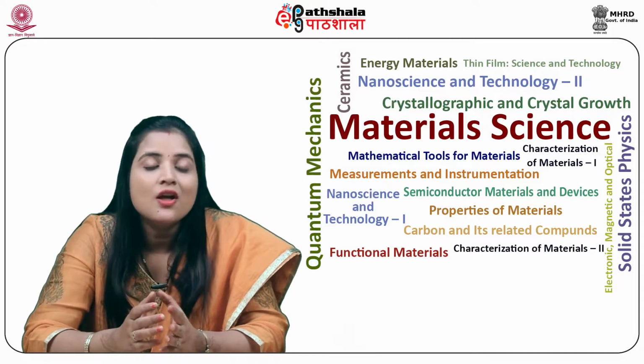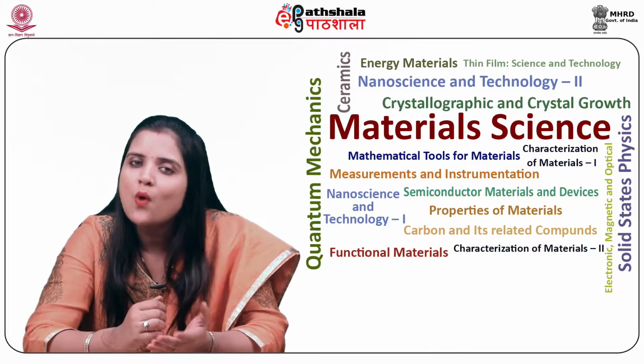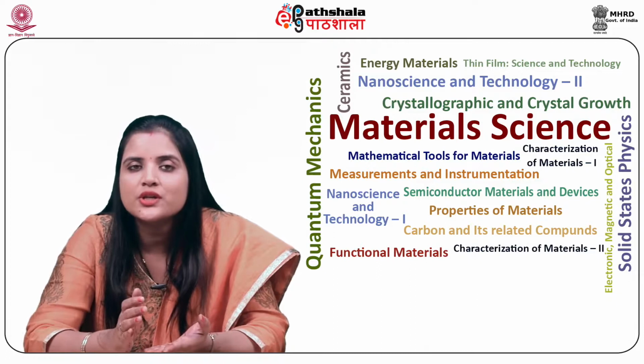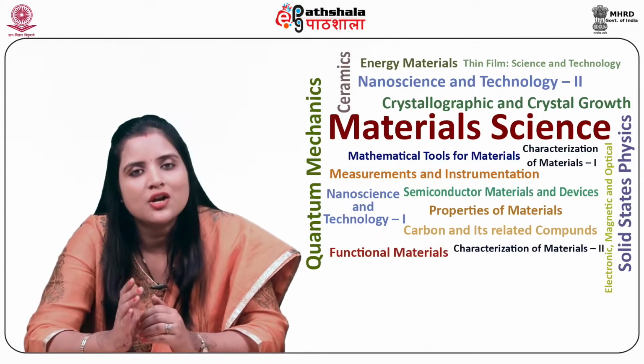We next study the non-conductive specimen analysis. For a non-conducting sample, metal coating is required in order to prevent charging.